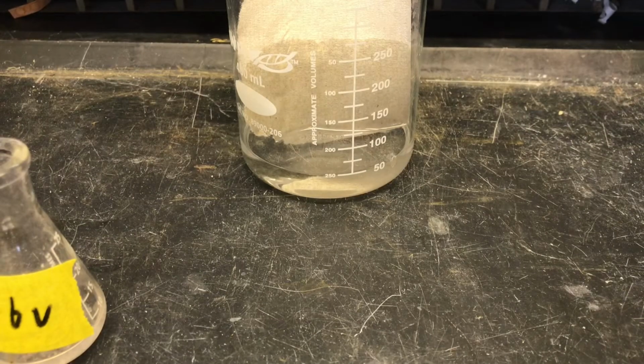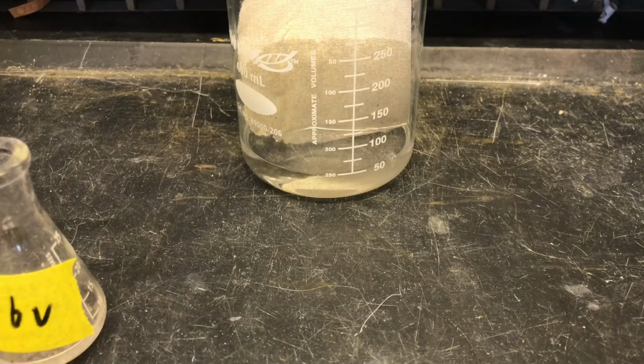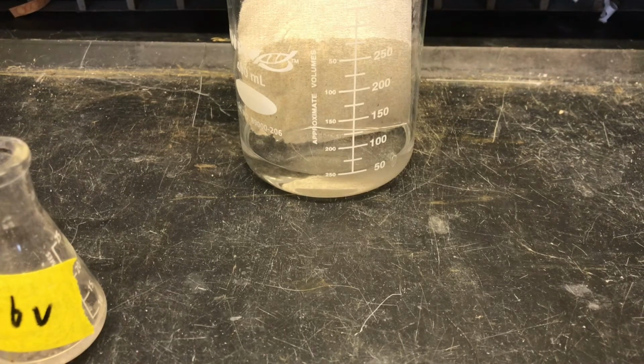Alright, now it's time for the part where the actual action happens. We're going to put the stationary phase into the mobile phase now, and we're going to hopefully get a good look at the mobile phase moving up the stationary phase, and then we're going to talk about Rf again, and do our final analysis on the situation.